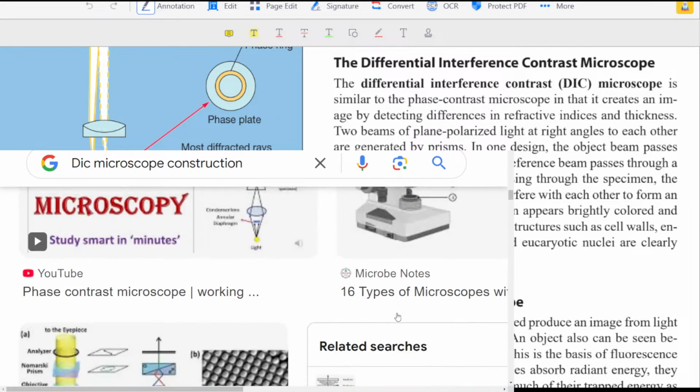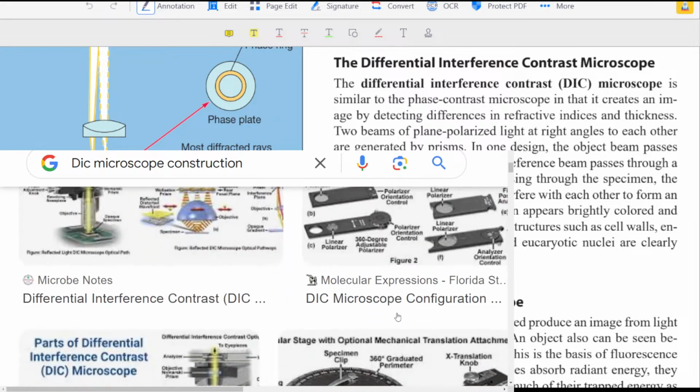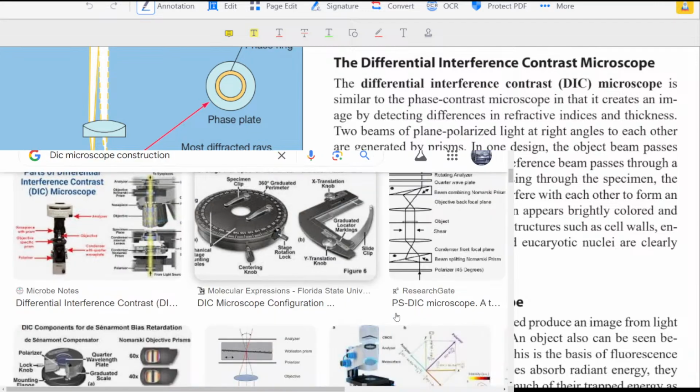Where did it go? Here. I can't enlarge it more than this. So if you look at this clearly, doesn't this look like 90 degrees? Almost 90 degrees. And this happens in the prism, but no, it has to be exactly 90 degrees. Why would I compromise on the angle?